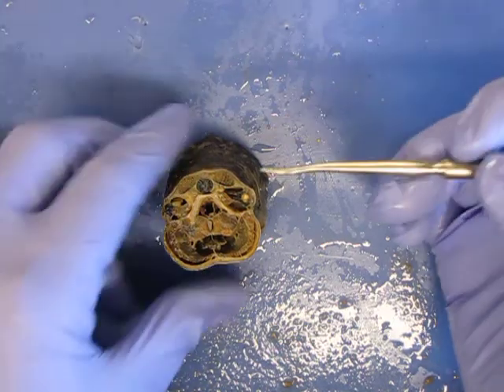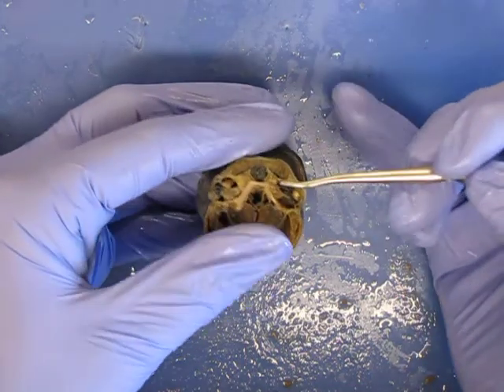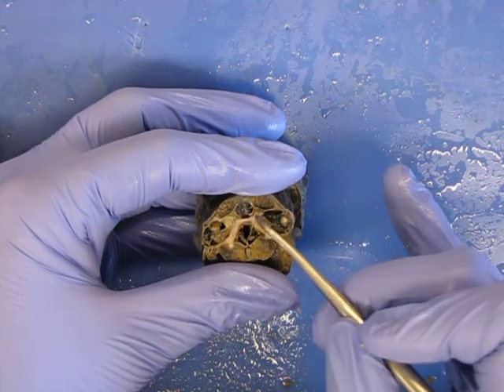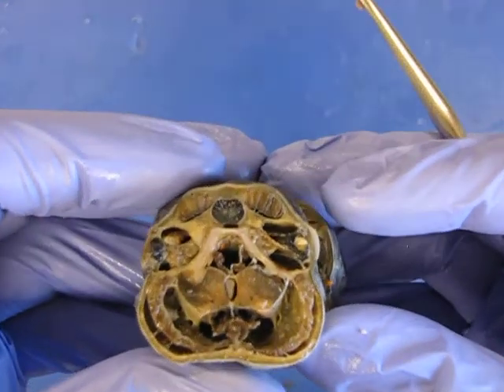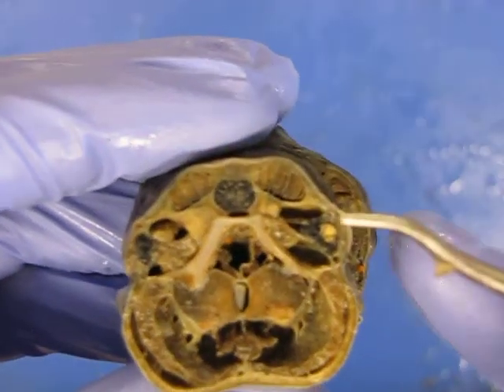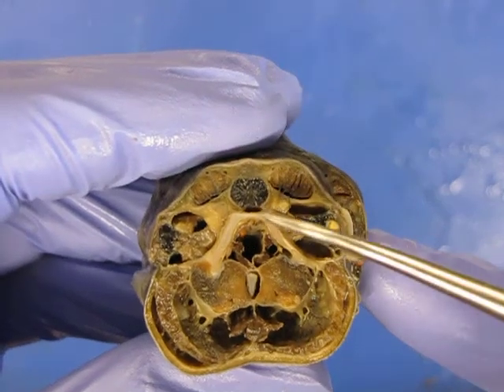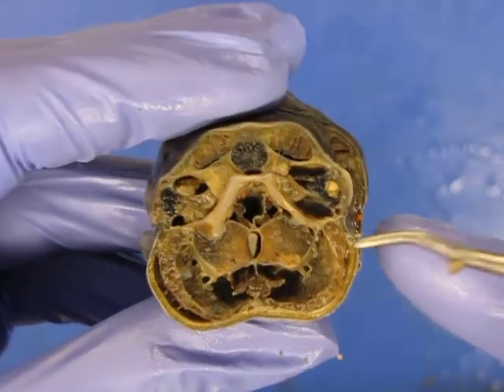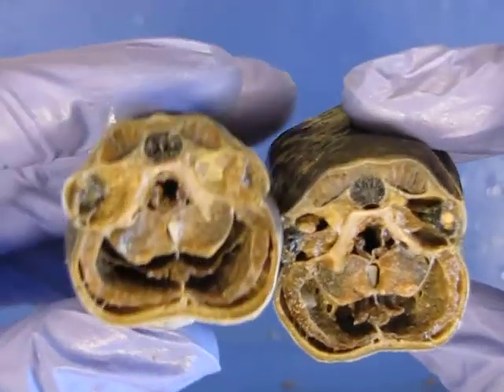Okay. So now I'm on the next section here, and I can see the olfactory sac here, and just underneath that, you see that pouch right there? There's your hypophyseal pouch. Okay. Now if you look at this carefully, see how well I can get it to focus before it loses focus. There we go, that's good. You can really see the increased surface area here. So water comes into here and there's just all kinds of surface area there containing chemoreceptors to be able to sense that water really well. Same thing on that one.